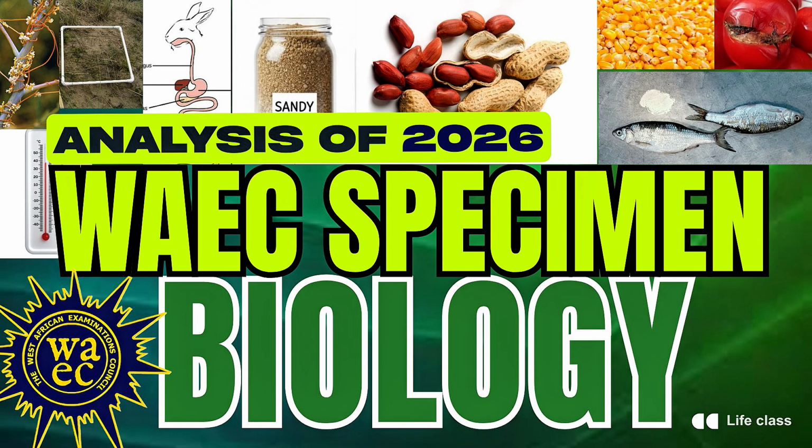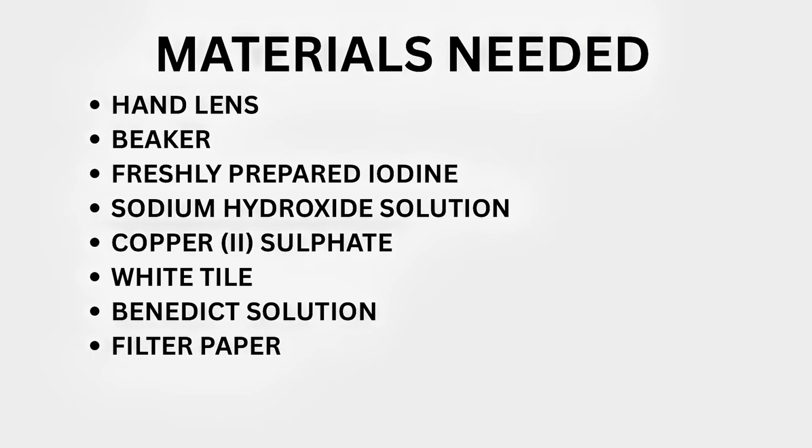So let's quickly analyze the 2026 WAEC specimen for biology together. Let's consider the materials needed for the practicals. The first thing we have here is a hand lens.